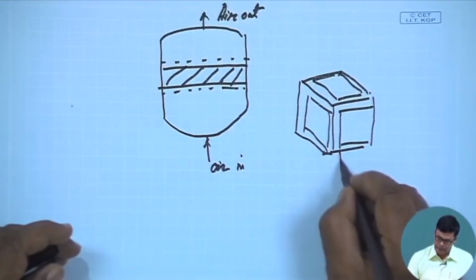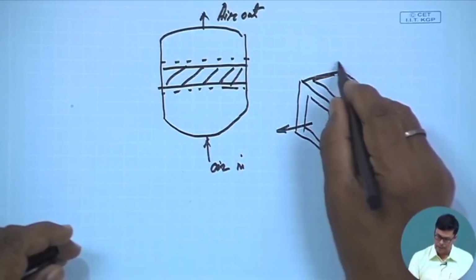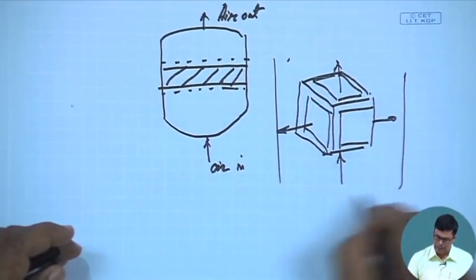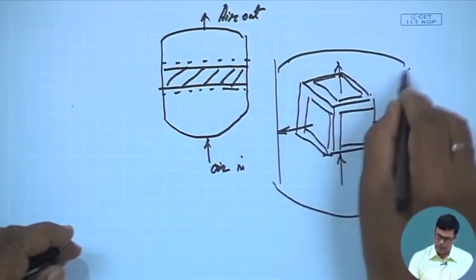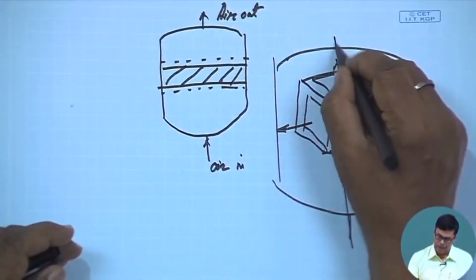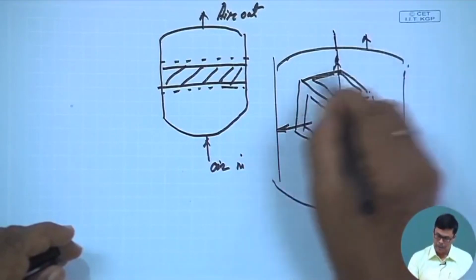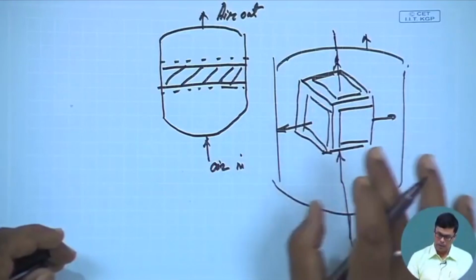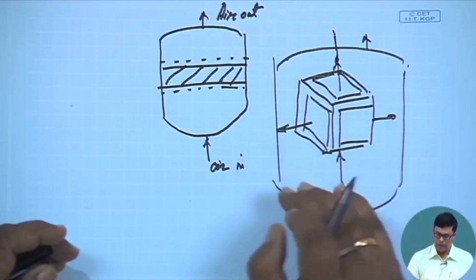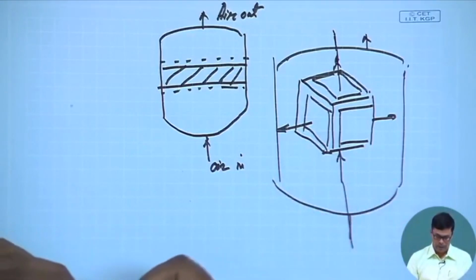So if you pass air inside, the air can come out in different directions. From the annular space, you can hold the assembly inside the filter and increase the surface area. So like this you can take the air out from here. The annular space makes the system very compact in case you require a higher surface area. This I forgot to mention in the last class.